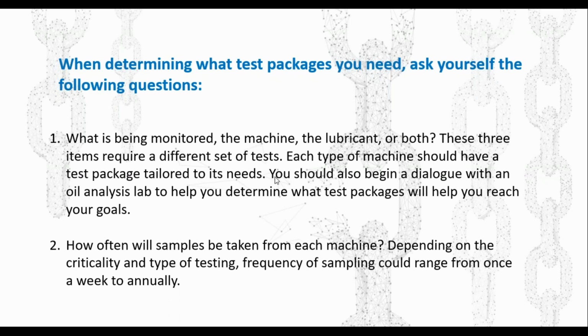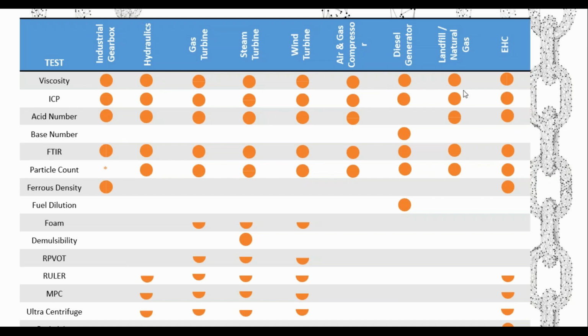When you look at test slates, I put together a little cheat sheet. It's not a completely exhaustive list by any means, but this is something that Justin and I wanted to put together to share with everyone to give a good baseline. The goal with this table is to give an overall view of what you may be seeing.